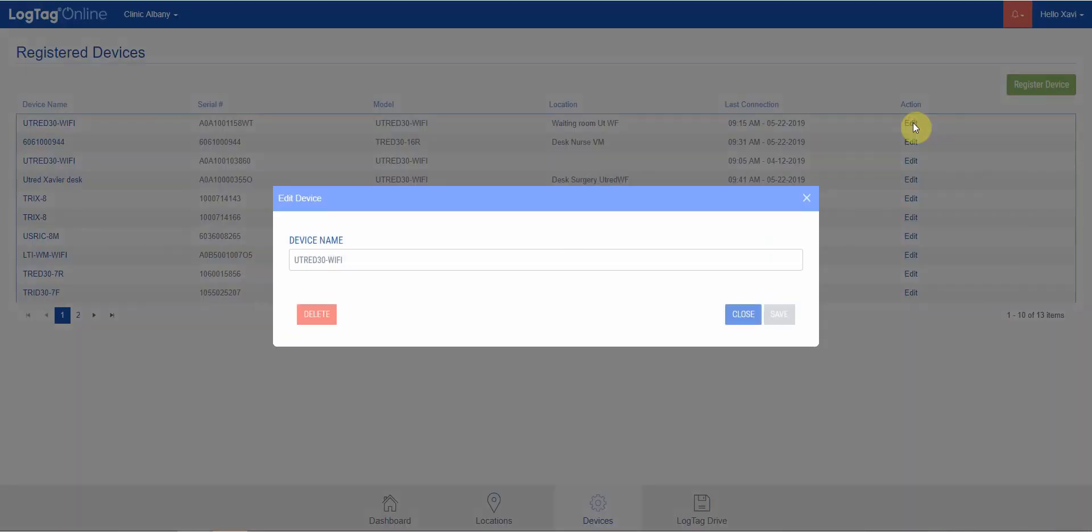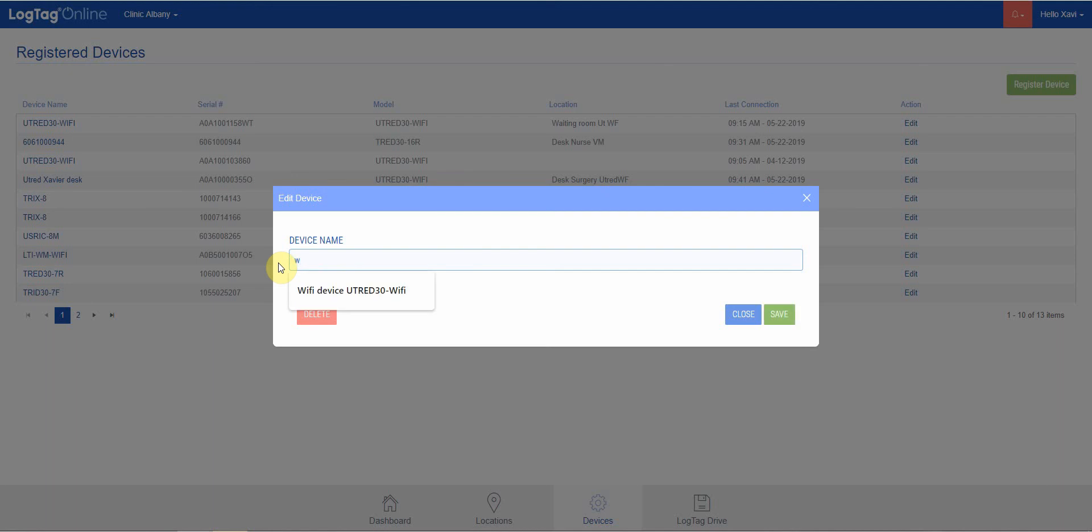We can edit the device to change the name to make it more user-friendly. For instance, if this one is in the waiting room, we can name it the waiting room logger.